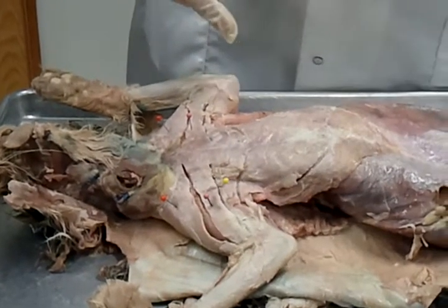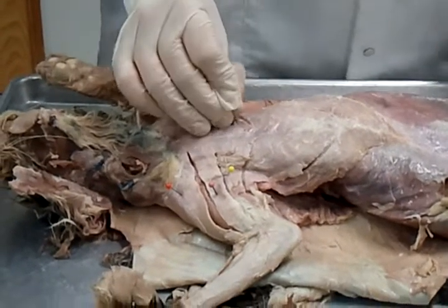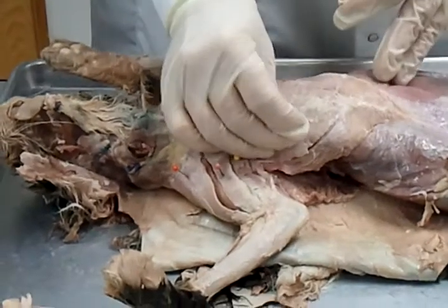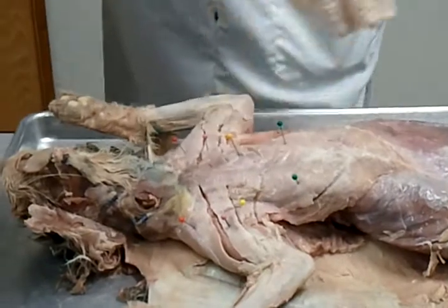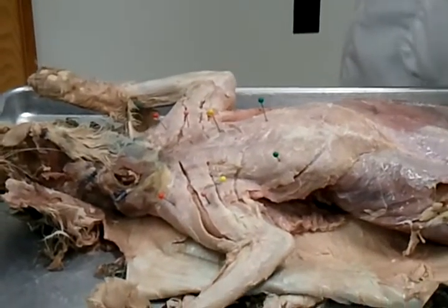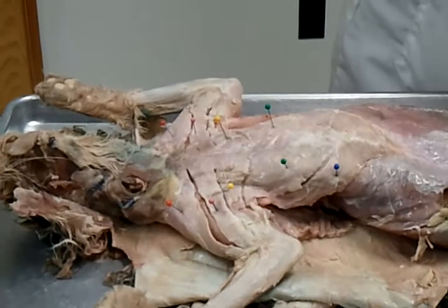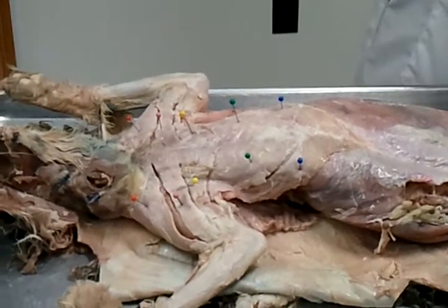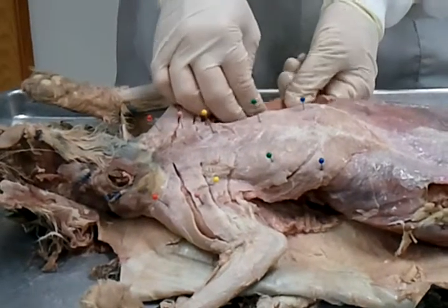In this cat, it was done on both sides. You do not need it done on both sides. It's just to help illustrate what the muscles look like. And if you look on the board, they're written kind of what those muscles are and what those numbers are, with colored pins. And then I'm going to show you on this cat and then let you guys go ahead and explore that on your cats.